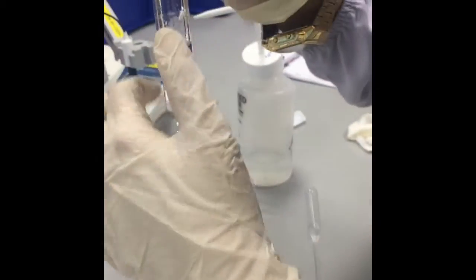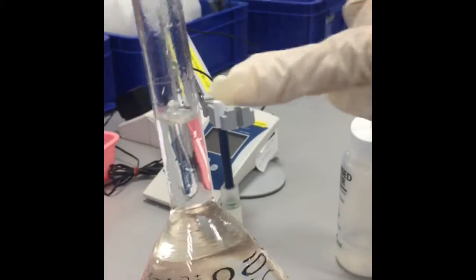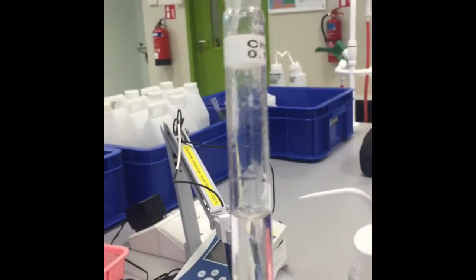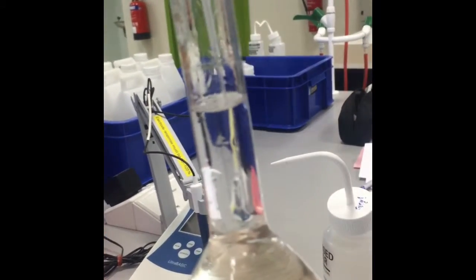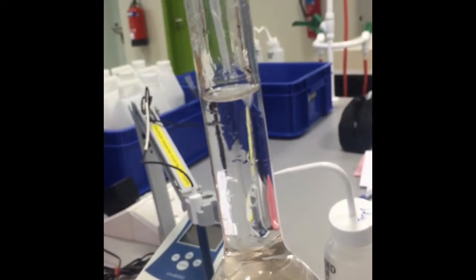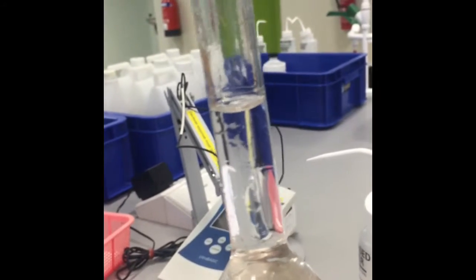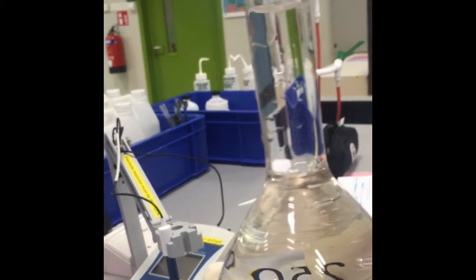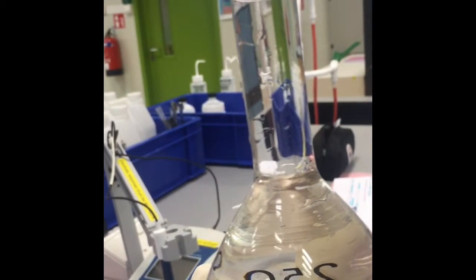So here is the maximum amount of deionized water that you should fill in with. Before reaching the mark here, use a pipette and top up slowly to ensure it doesn't exceed, as when you exceed the amount that you should be filling in with, it may lead to inaccuracy of results.